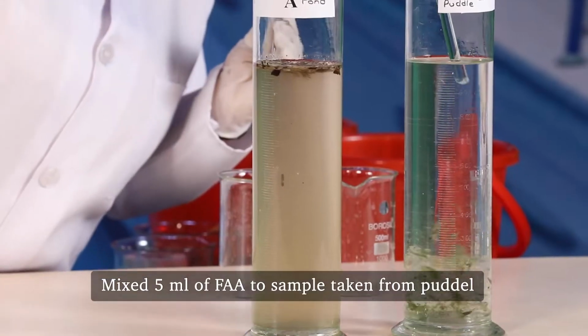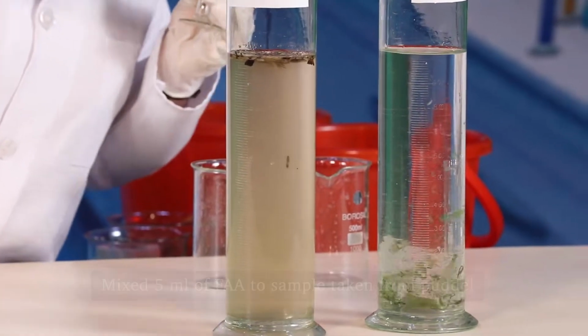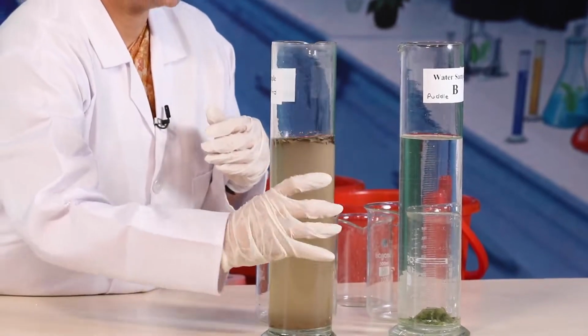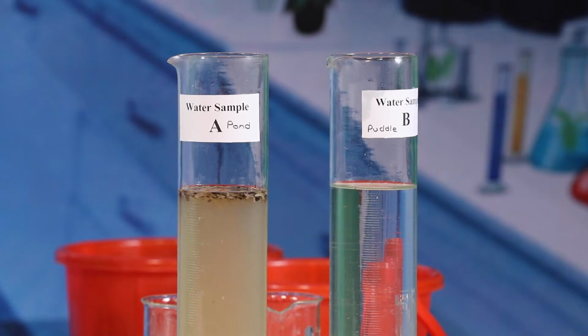Now we will leave the samples undisturbed for 48 to 72 hours. After 2 to 3 days, you will observe concentrated sediment at the bottom with clean water above.